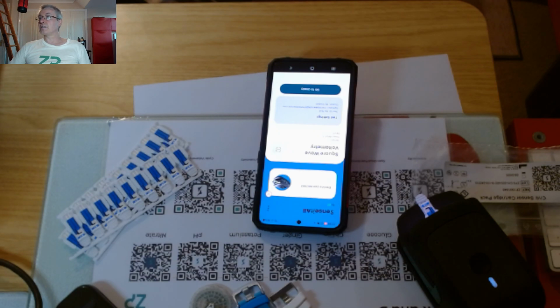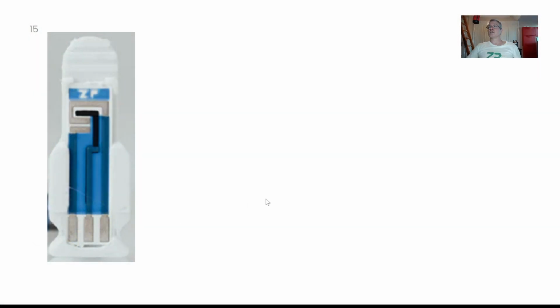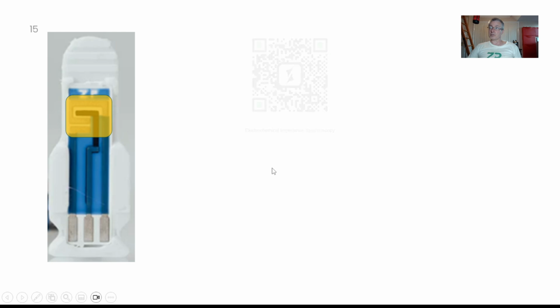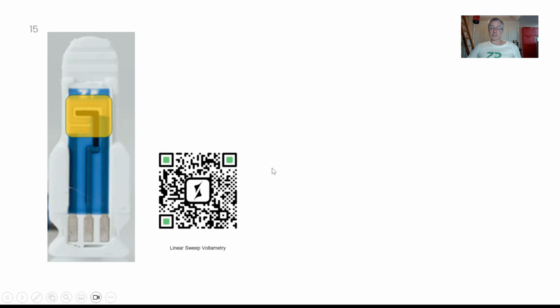And I will just put my hand back on the hardware here, and you can use that then in biofilm monitoring or biofilm analysis. What I'm imagining is that you have this cartridge and you put a solution on there. As that biofilm develops, it will start impeding the electrodes, and you'll be able to pick that up using amperometry, or using impedance spectroscopy, or with linear sweep voltammetry.